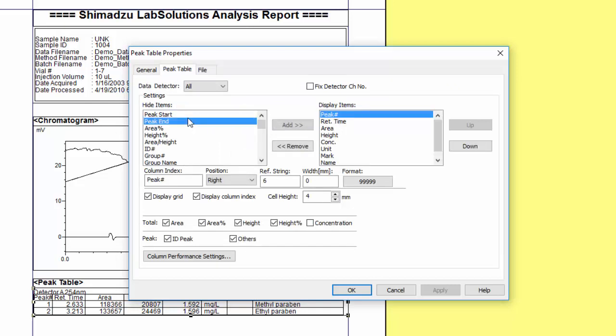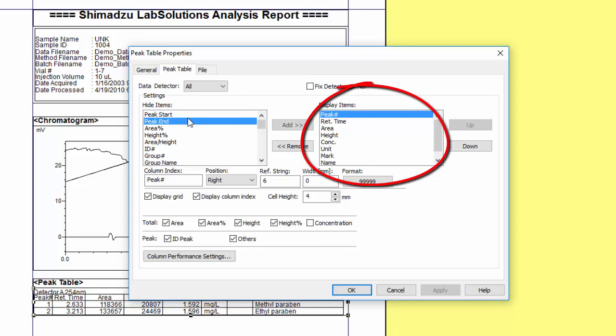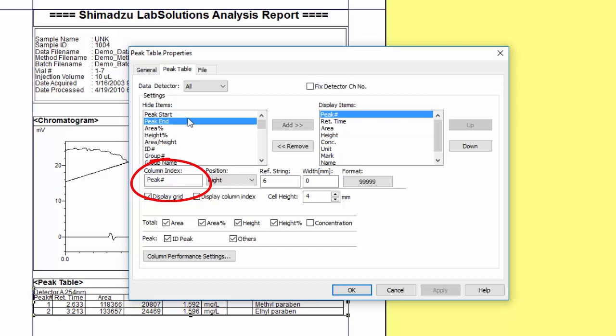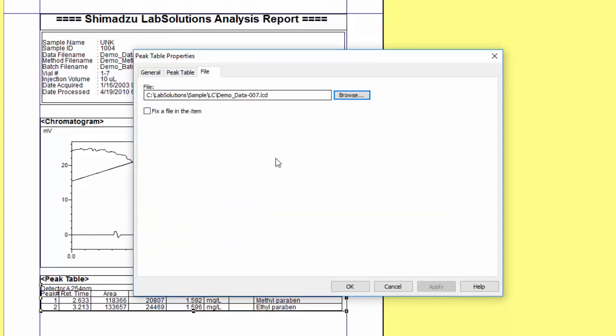You can select to display any option in any order in the peak table. The column order top to bottom is left to right. You can also adjust the width of the column by adjusting the reference string value. You can also adjust the column heading labeled as column index to help you narrow the column widths without cutting off any text. As an example, you can shorten the limit of detection to LOD to help keep the column width down.